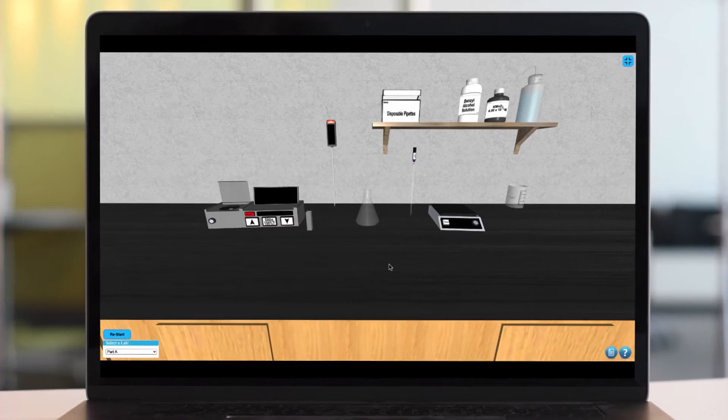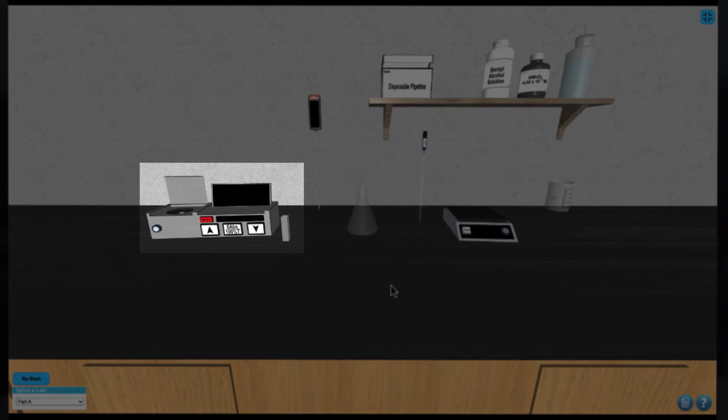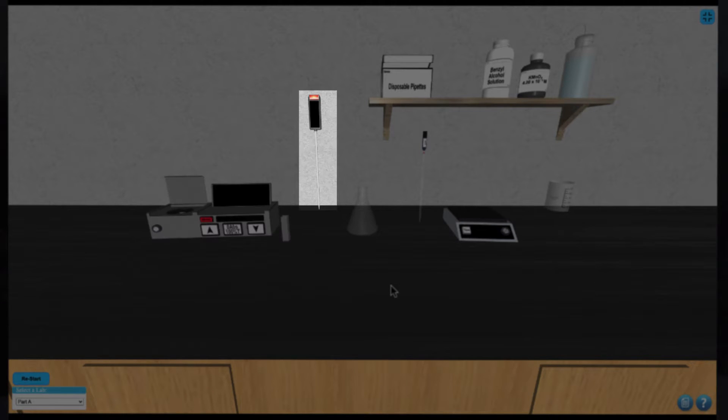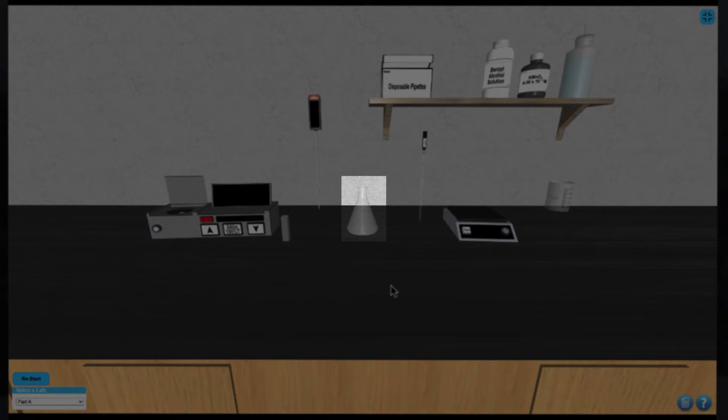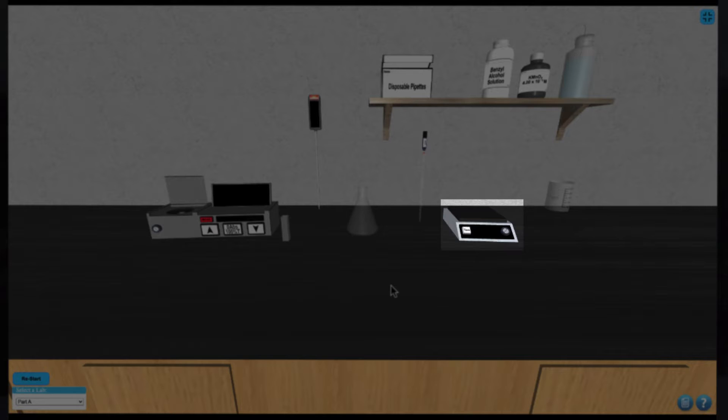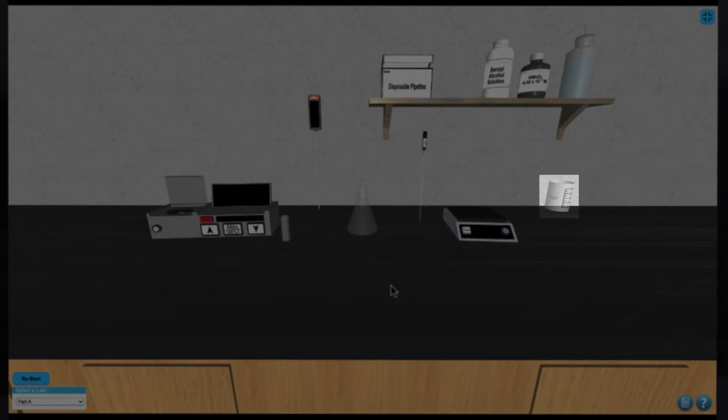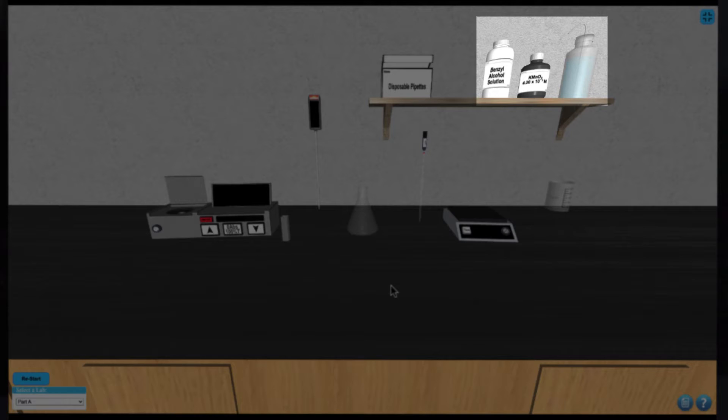In this simulation we have a spectrophotometer, a digital thermometer, an Erlenmeyer flask, a pipette, a top loading balance, a waste beaker, some disposable pipettes, and some samples to work with.